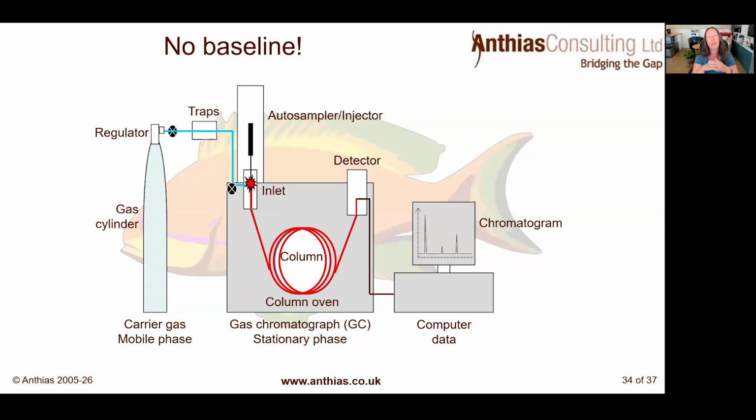Is there any threshold value or cutoff of what's actually being saved in your chromatogram? So it's going to be basically your detector acquisition parameters. That's the problem with that.